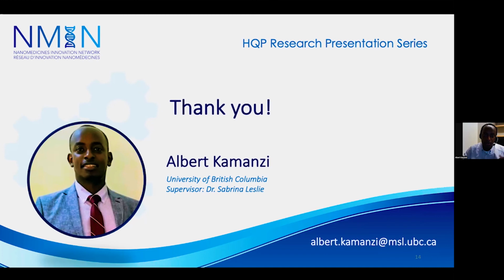At the lower end, you want to image fast enough, so the limit will be how fast your camera can go. At the higher end, it's the depth of your well. You want the wells to be deep enough that you don't feel the surface effects, but if they are too deep, then it's a question of whether your objective can keep the sample in the imaging plane. So I would say tens to hundreds of nanometers.